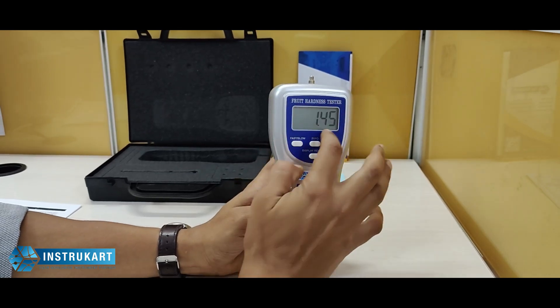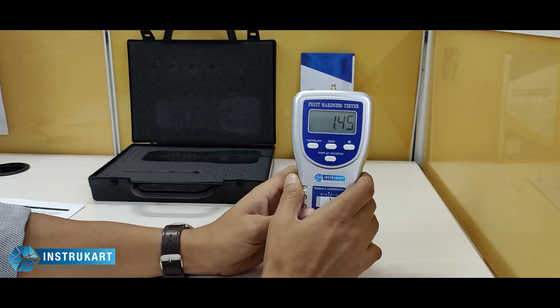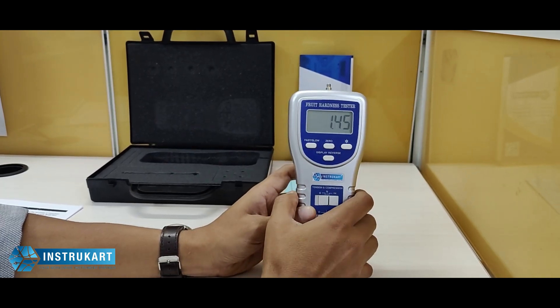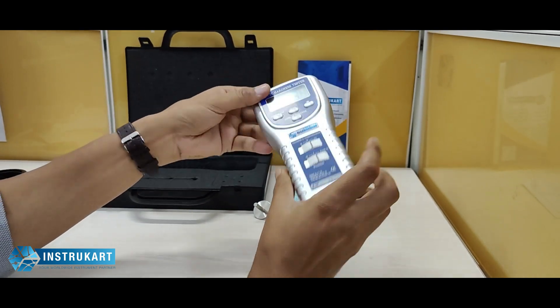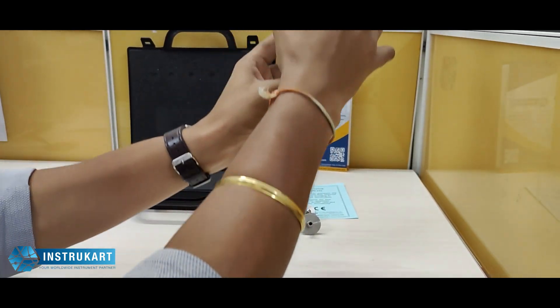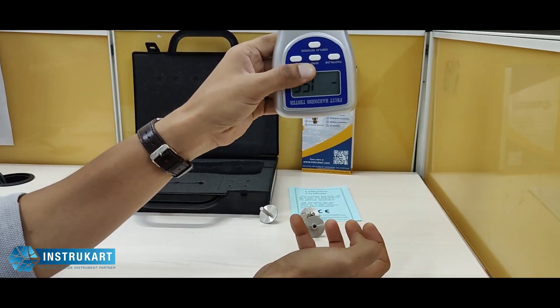As you can see, this has a large LCD display for better readability when taken to the field or used in the laboratory. As an optional accessory, it comes with a stand, which means it can be fitted on the stand and the fruit or object can be placed at the bottom.